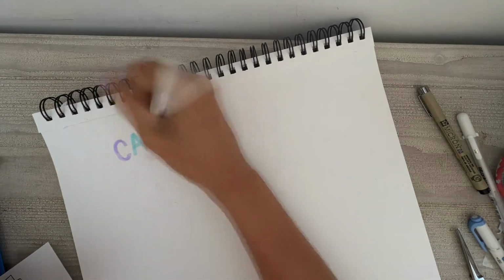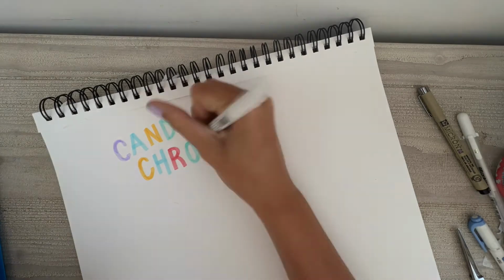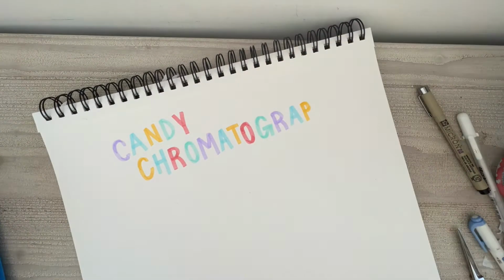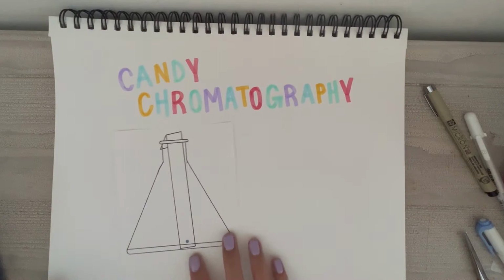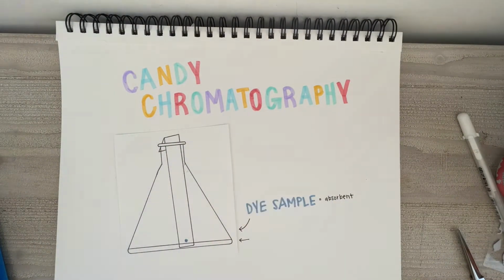To start the candy chromatography lab, you first have to know what chromatography is. It's a process that uses the varying polarities of compounds within a substance to separate that substance, but it can also be used to determine the presence of a substance within a sample. This process consists of two parts: the absorbent, which in this case is the dye sample, and the solvent, which in this case is the eluent solution.